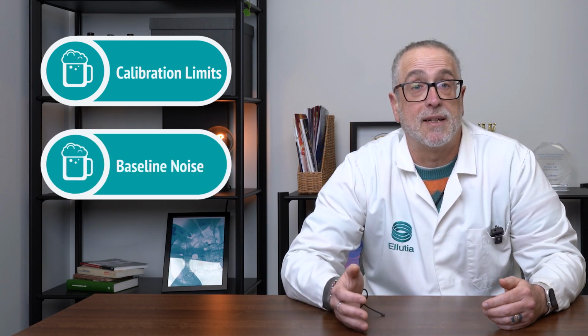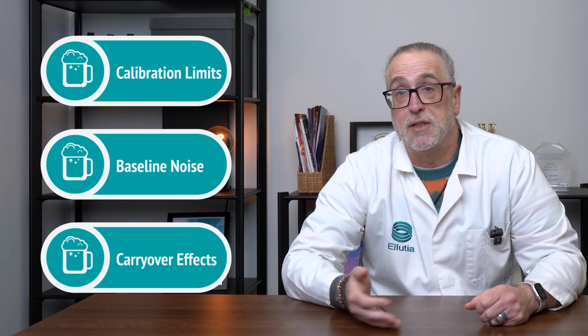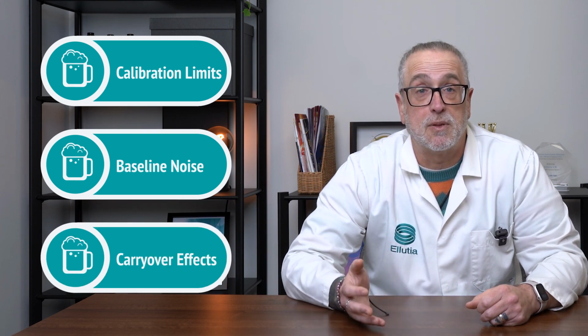This is usually when producers begin to see results that feel inconsistent or are difficult to explain. Calibration ranges often do not extend far enough down to remain reliable. Baseline noise becomes a real factor rather than just background detail. Carryover and residual effects that were previously invisible start to matter. The method is being asked to operate outside the range it was designed for. Nothing has gone wrong, it's just the measurement challenge has changed.